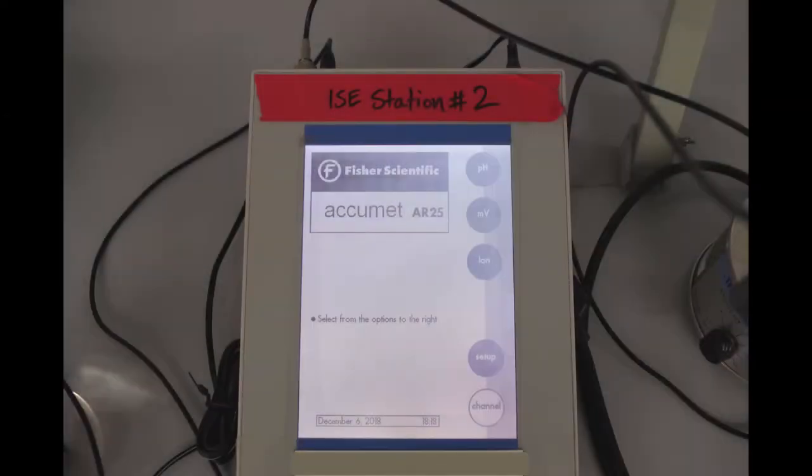Before proceeding, check to make sure that the meter is on and in standby mode.